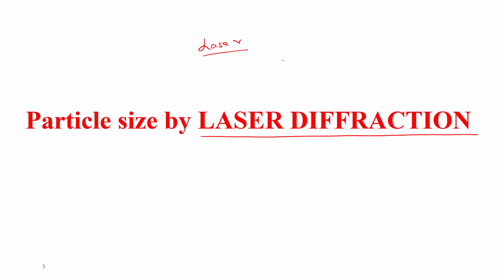That is meant to say that when a laser is passed through the particles, they will scatter the light at different angles, and also at different intensity.